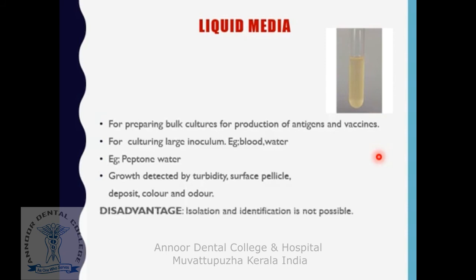The disadvantage of liquid media is that, unlike solid media, you will not get individual colonies. So isolation and identification is not possible in a liquid media. So if you are going to cultivate in a liquid media, after getting growth in the liquid media, you have to subcultivate to a solid media. Then only you will get isolated colonies of bacteria.